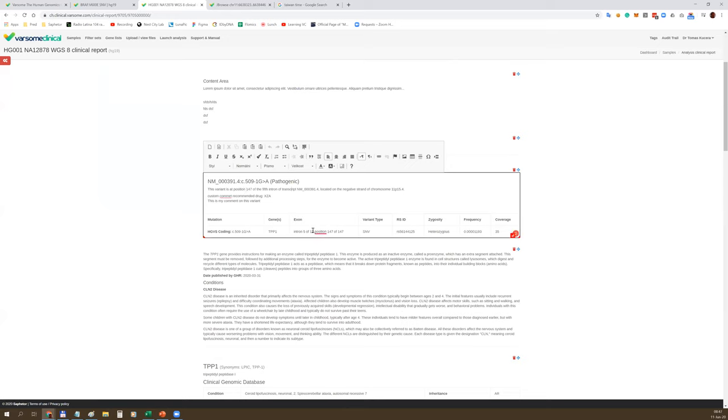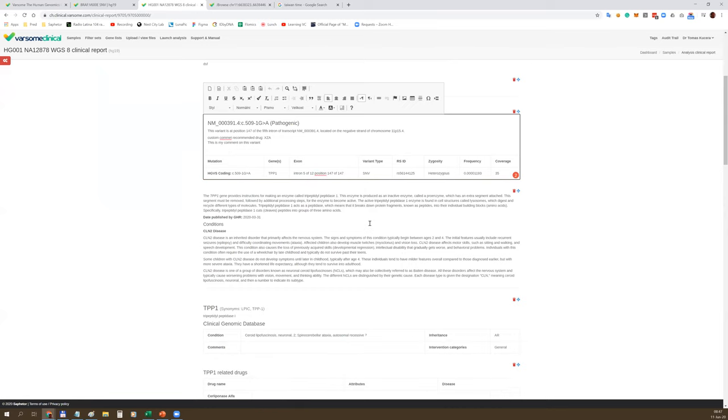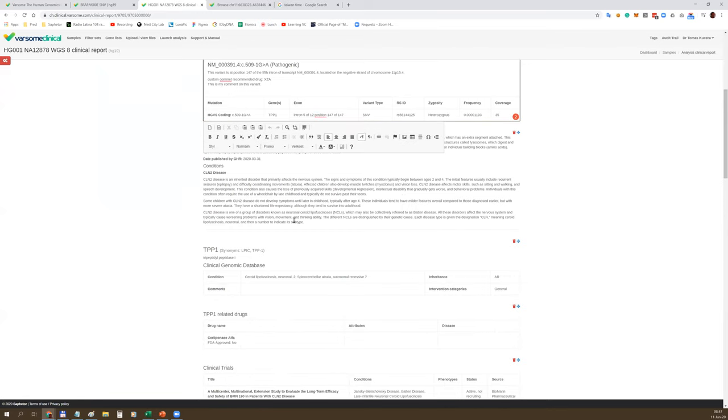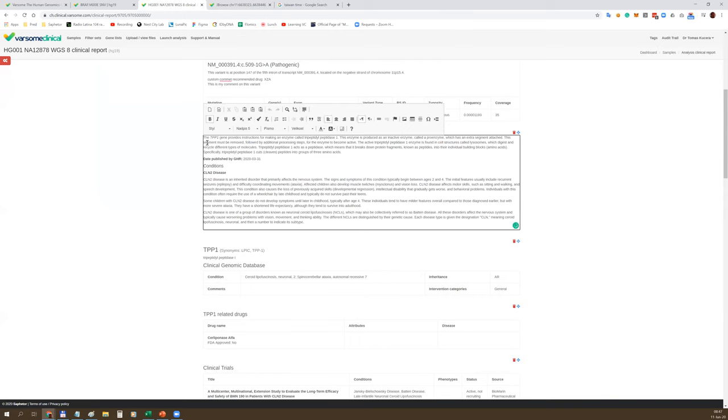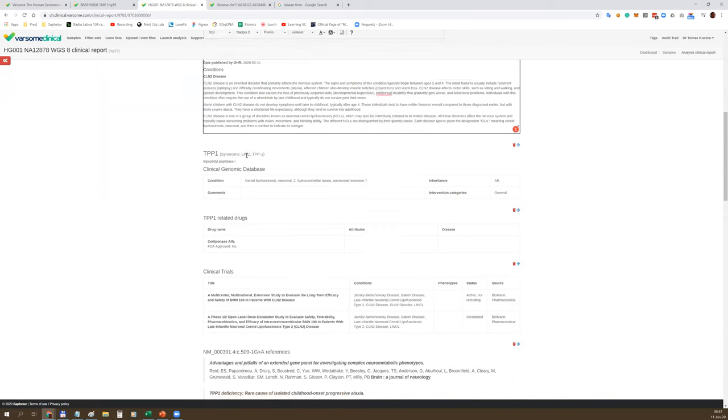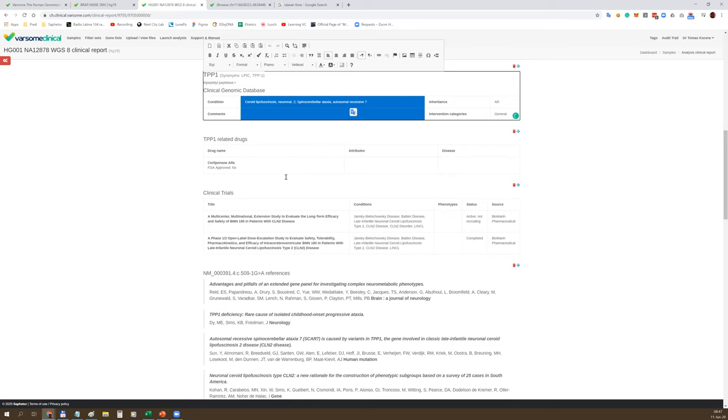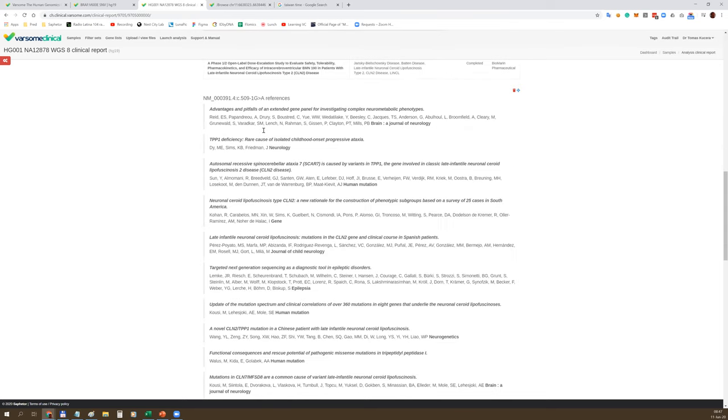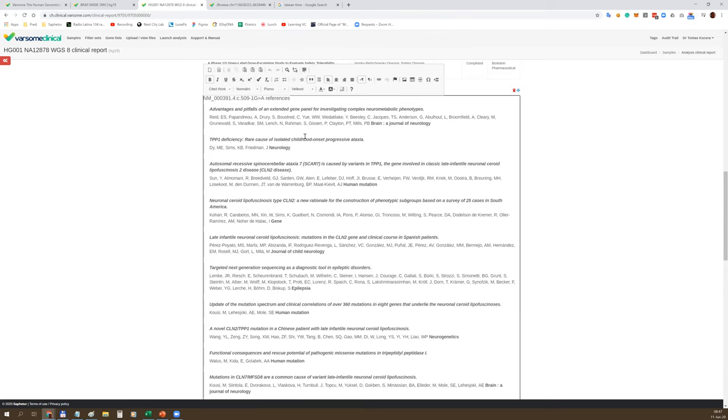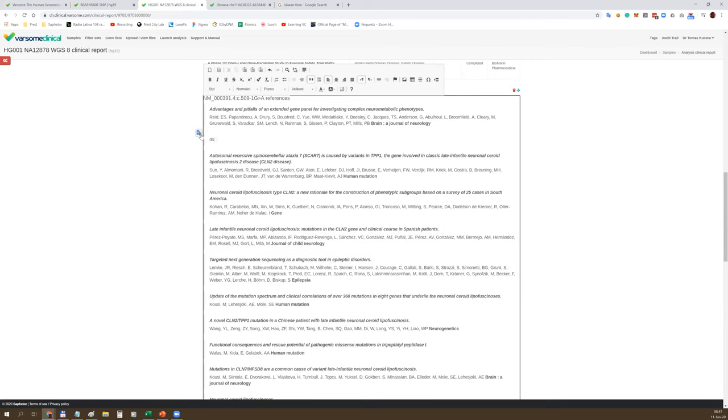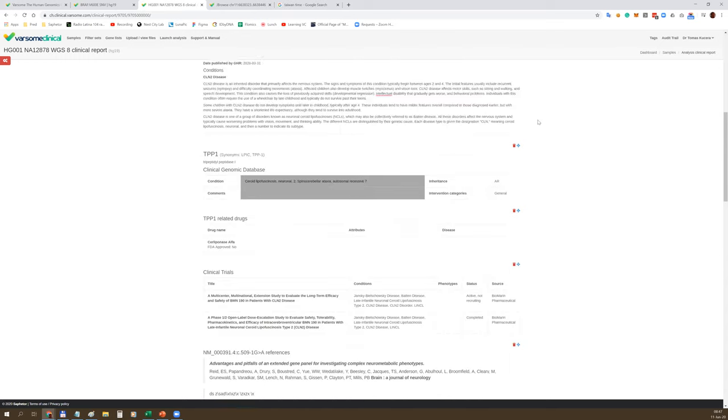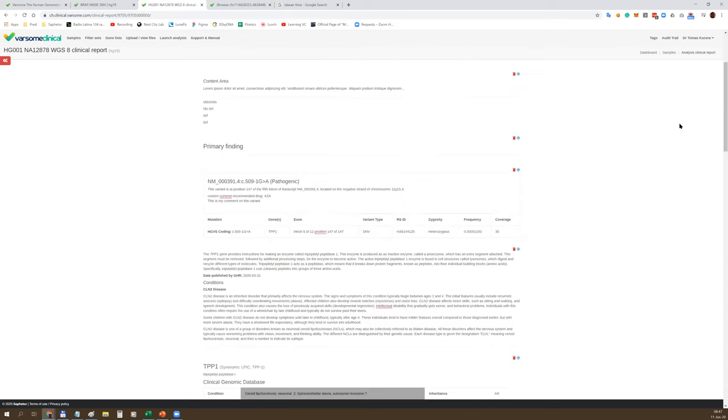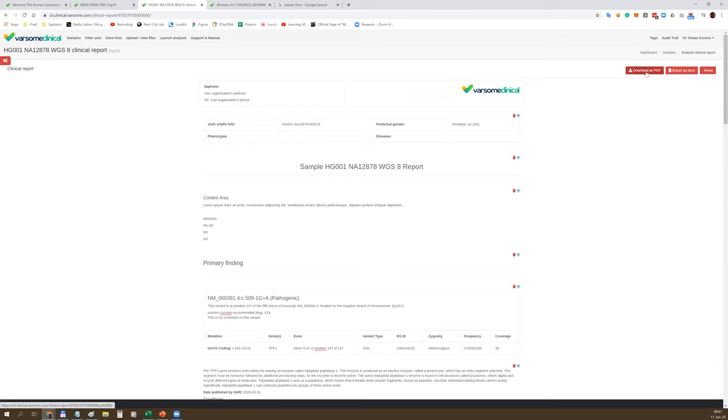Everything is fully editable. Here's the content area which allows you to provide your comment for the report. You can include pictures and tables. Here's the information for the variant - HGVS term, chromosomal position, rsID number, zygosity, and so on. Clinically relevant data for genes, phenotypes, and diseases. List of clinical trials, list of drugs, and list of references, list of publications. Everything is fully editable - you can easily remove publications or add new ones. At the end, you can download it as a PDF file or as a DOC file.